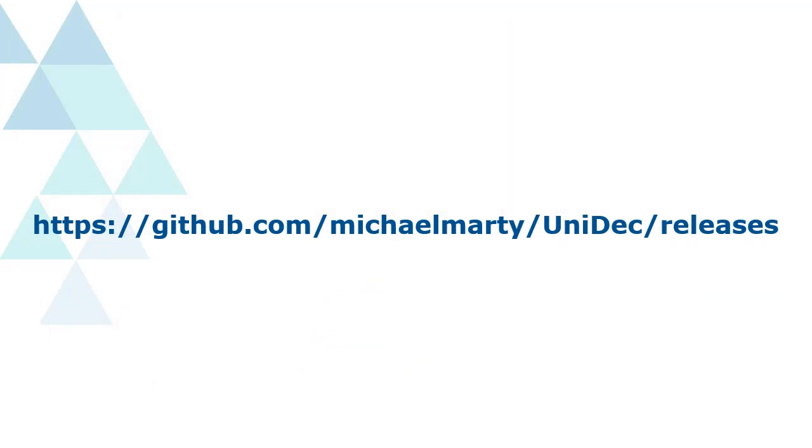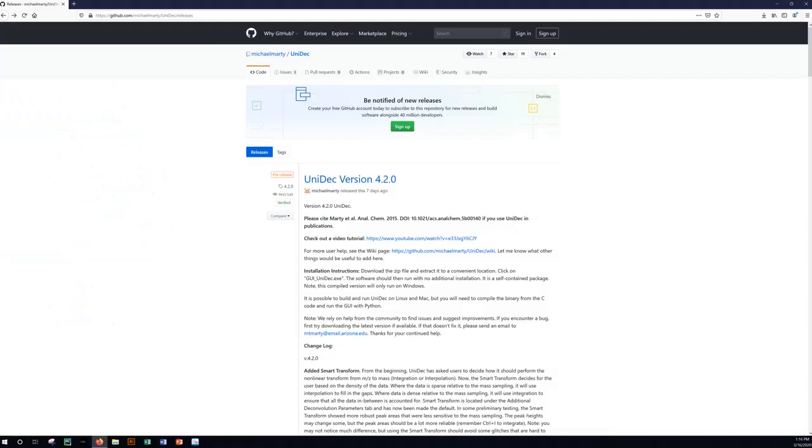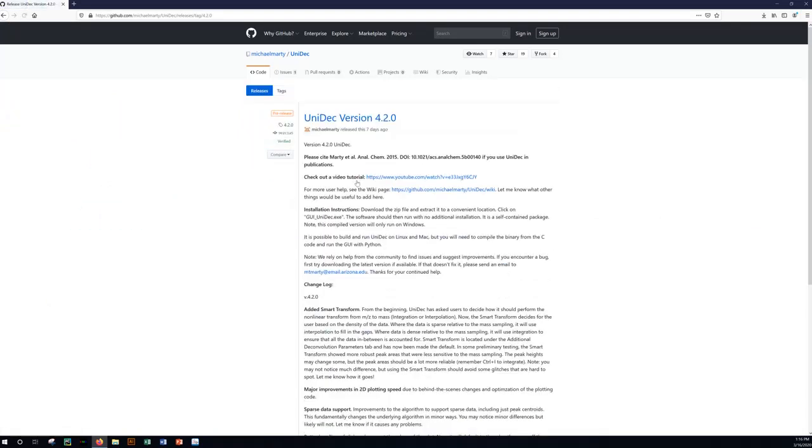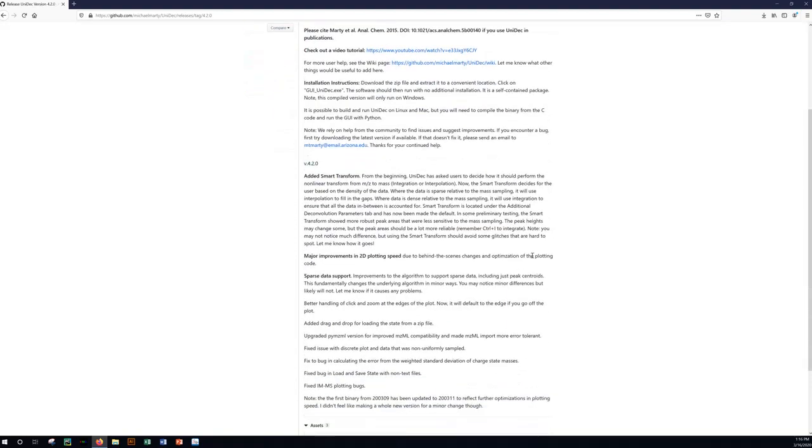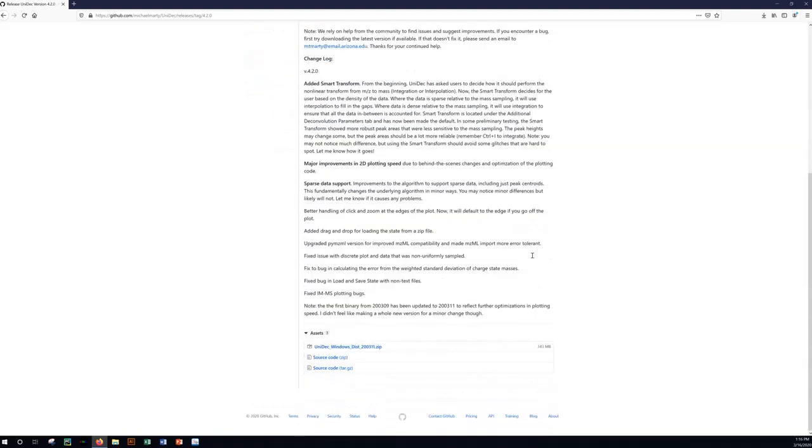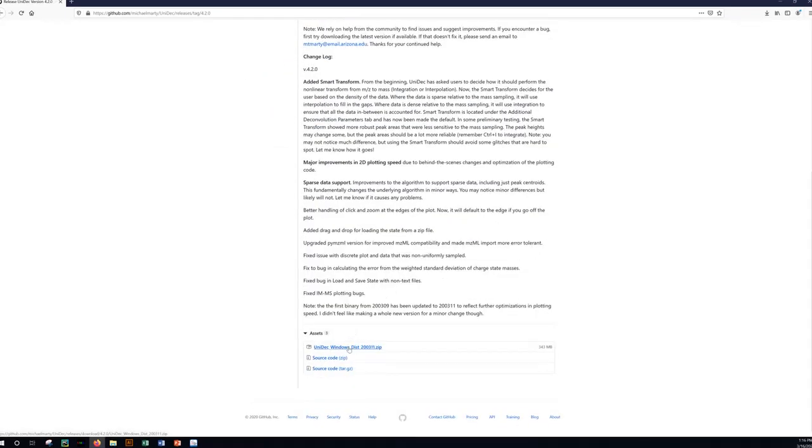Unidec can be easily downloaded at GitHub. Click the latest version of Unidec, scroll down, and download the zip folder. No further installation is required.